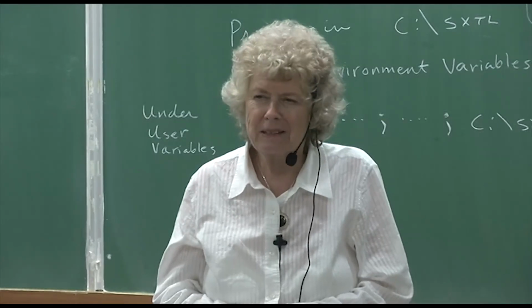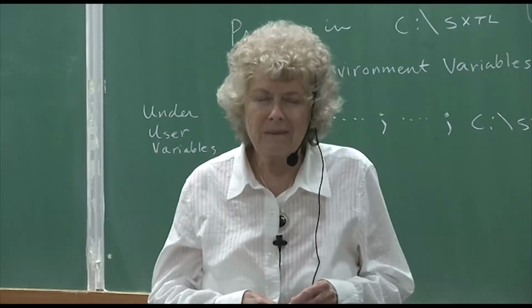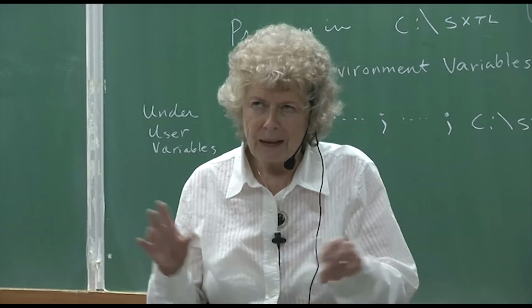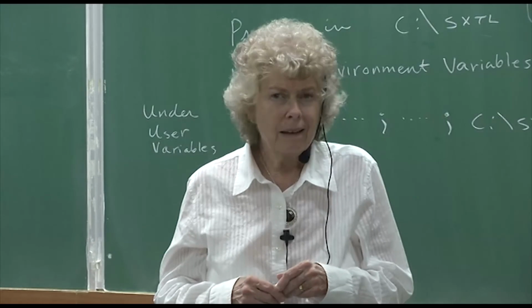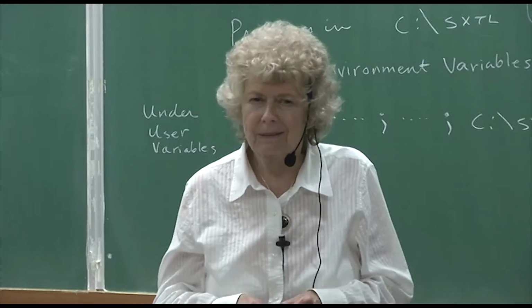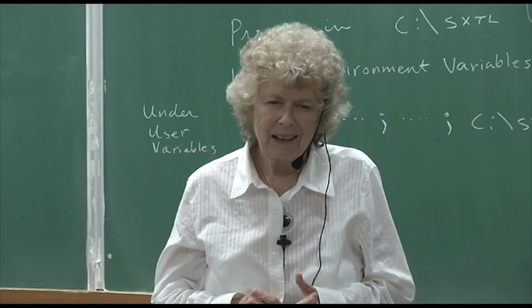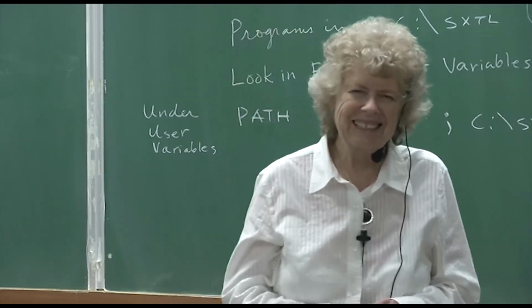What else can you do? Some things just don't go away. But sometimes it's good advice, so it's good to read it. And even the G alerts are sometimes good advice. A G alert may say, this space group could possibly be something else to a 93% probability. 93%, I would consider that maybe the space group is wrong. But it might only be a G alert. So the CIF checker is powerful, but also kind of discouraging sometimes. Like I said, I think I've only had maybe 1 in 100 structures that says, congratulations, you have no alerts.